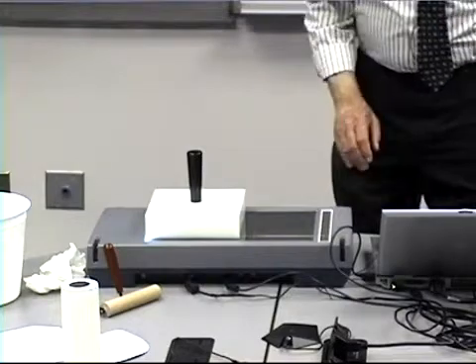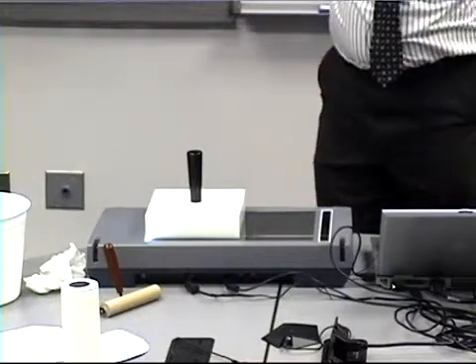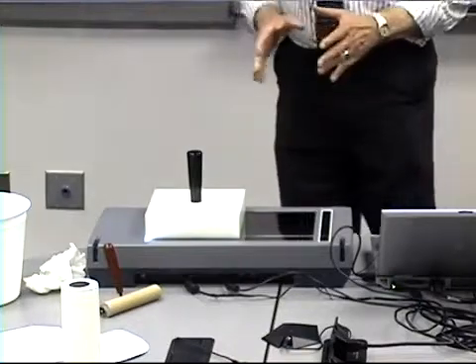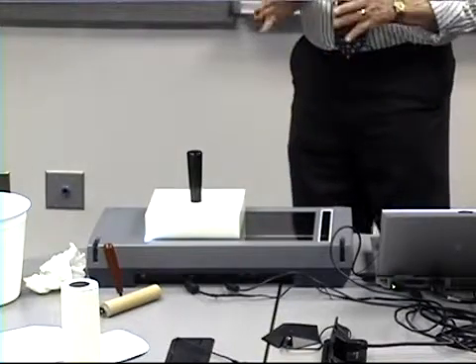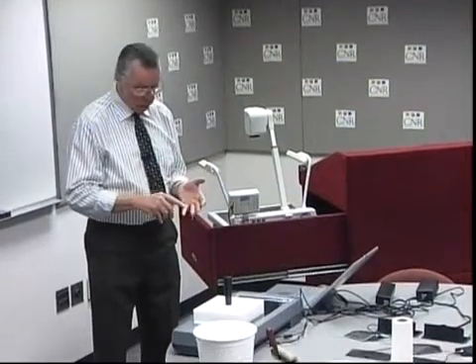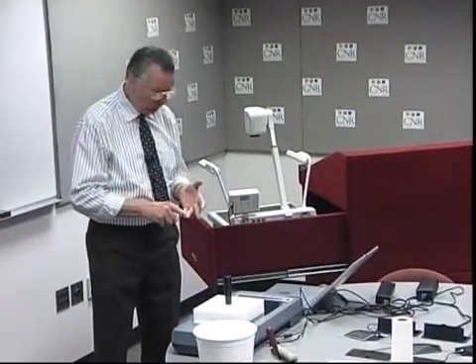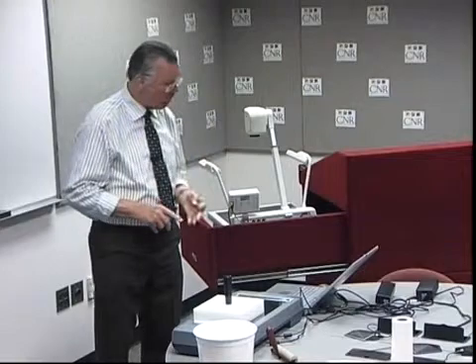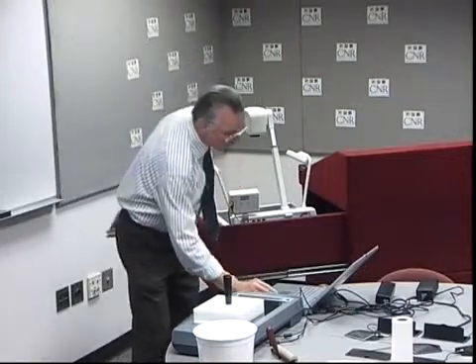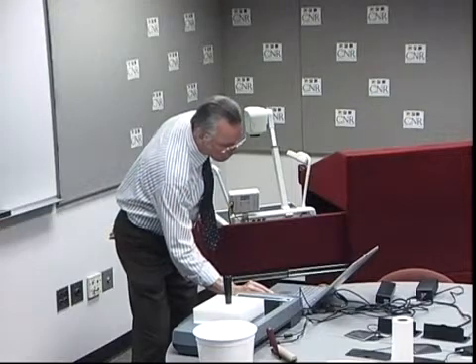But in addition, it is able, in the analysis, to separate up to 5 different objects with different characteristics altogether. For instance, we have the fibers, and we have the hairy stickies, and we have the stickies. We have 3. It's able to do 5, but we're only interested in 3 in this particular case.